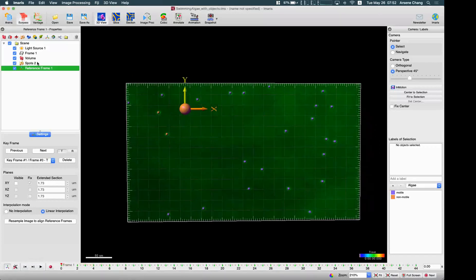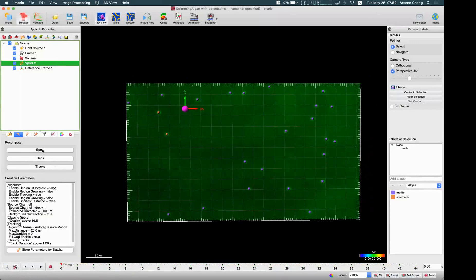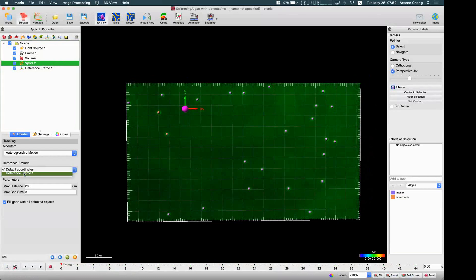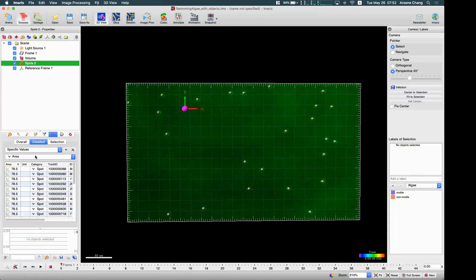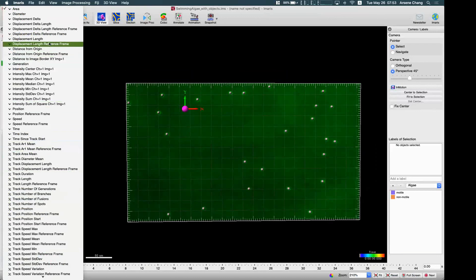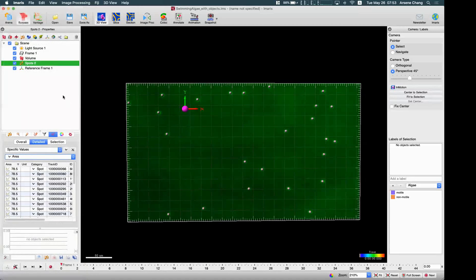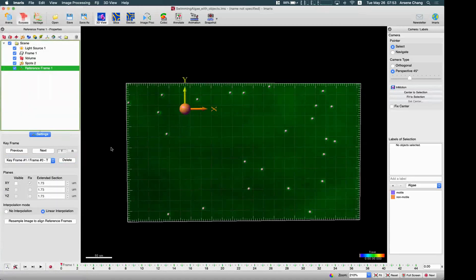After we have the reference frame, under the spot object, we need to redo the tracks. This time we can track according to the reference frame, so if you want to calculate the movement based on a second coordinate system, after you set a reference frame, you can go back to the spot and redo the tracks — and here select the reference frame. In the track result, you will have this reference frame-related tracking result as well.